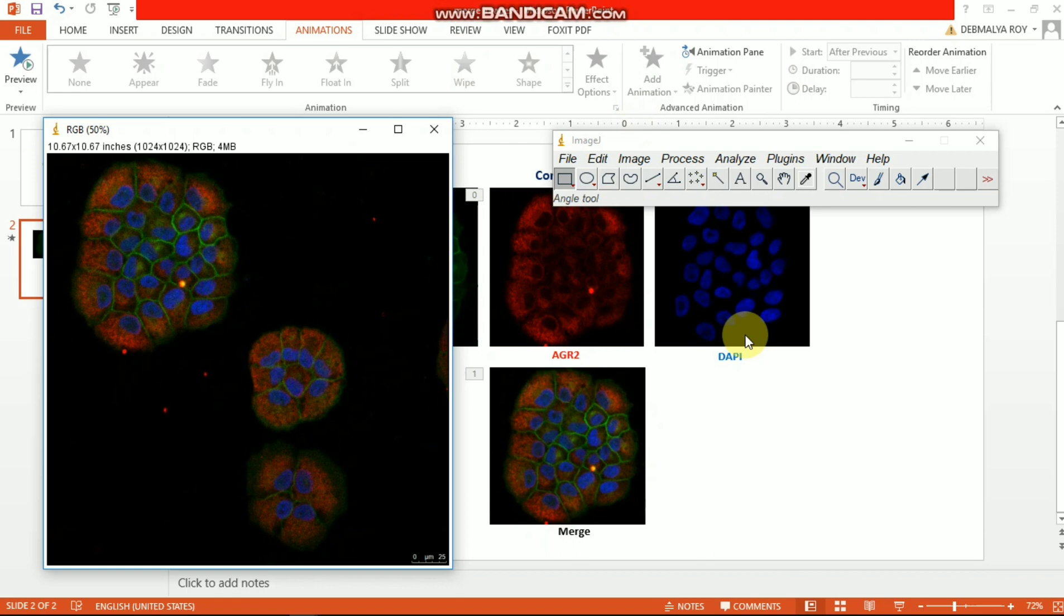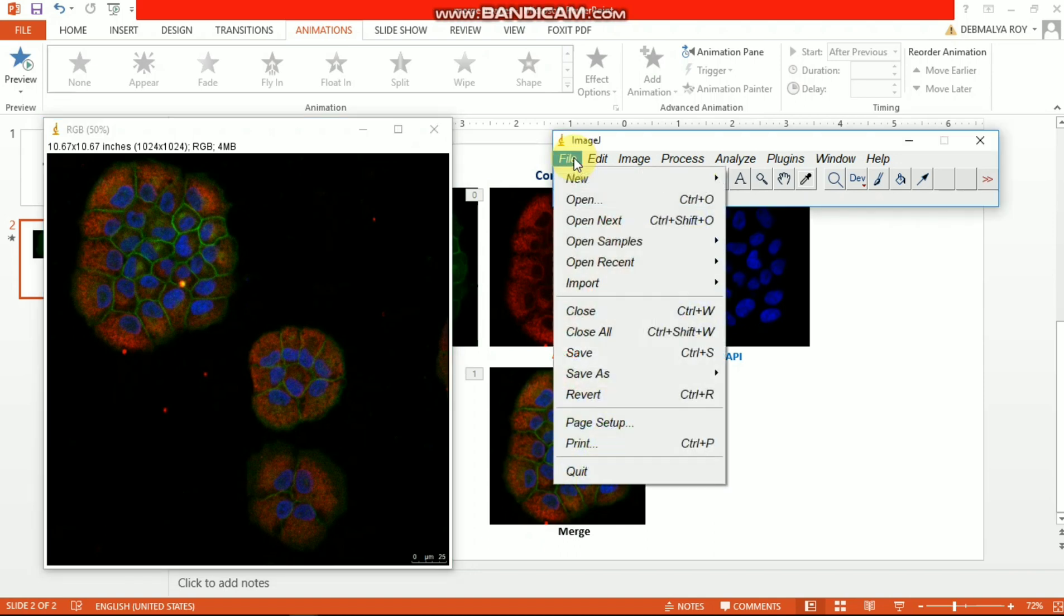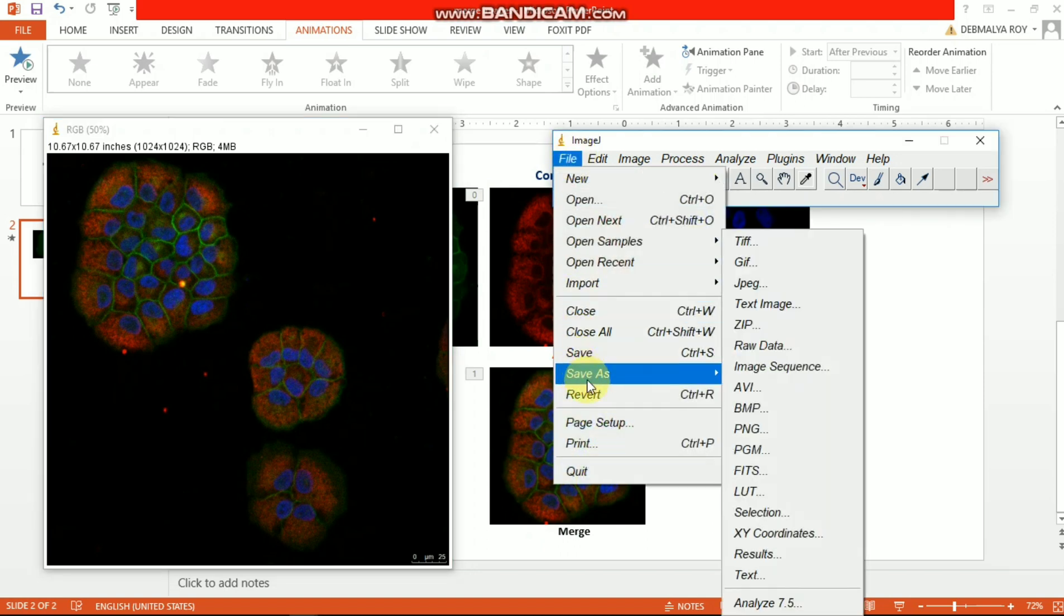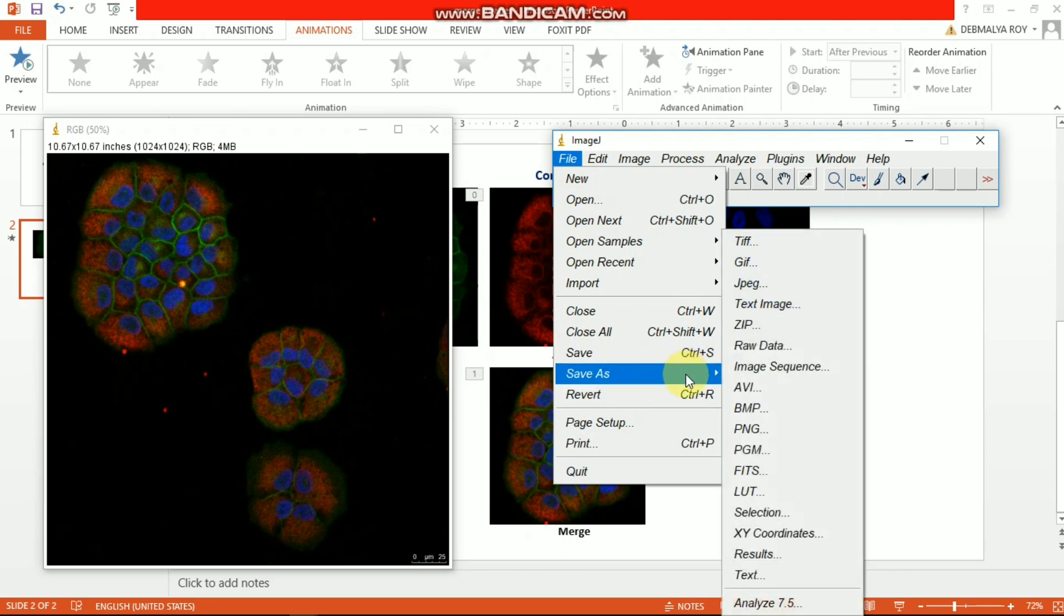At the end, I want to show you how to save this image. From here you need to go to File, and then from the Save As menu you can see there are a lot of file types, but mostly you need to use the TIFF file. So you can choose this TIFF file and you can find your location where you want to save.